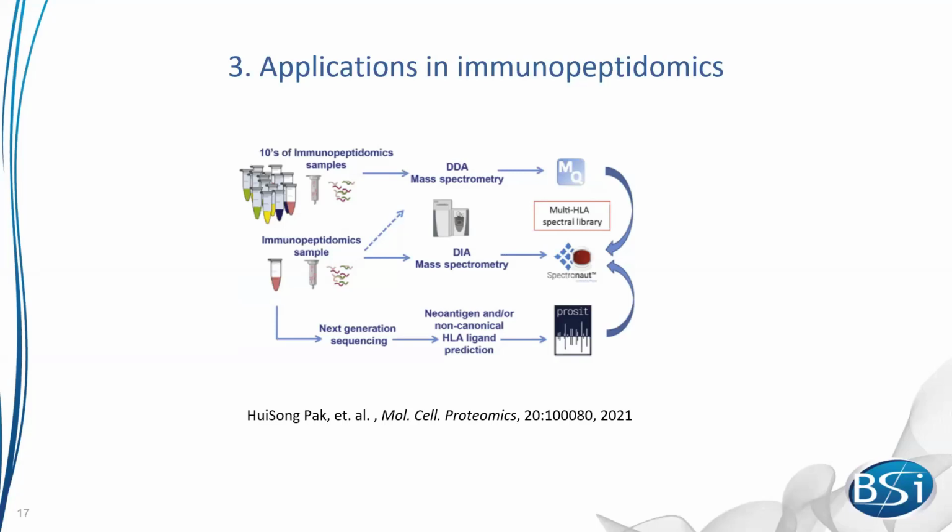With this work, they successfully found almost 2 to 3 times more compared to the original traditional library search, compared to the MaxQuant-only result. That's really fascinating.